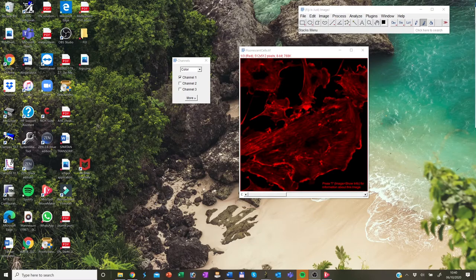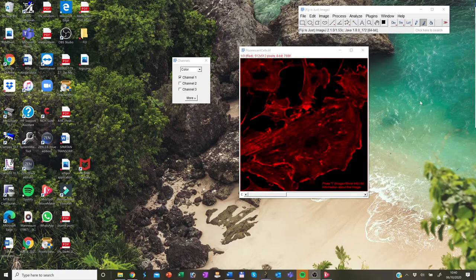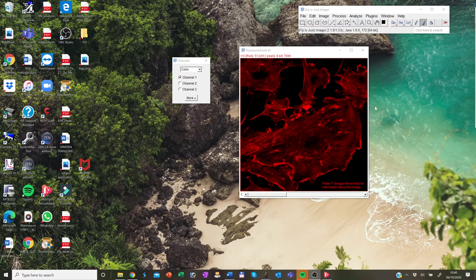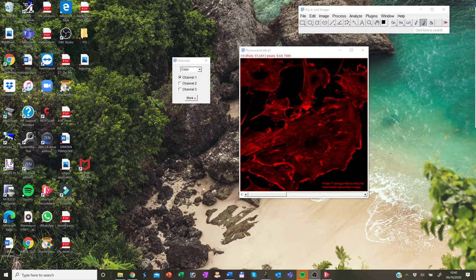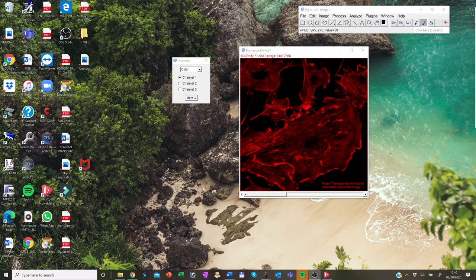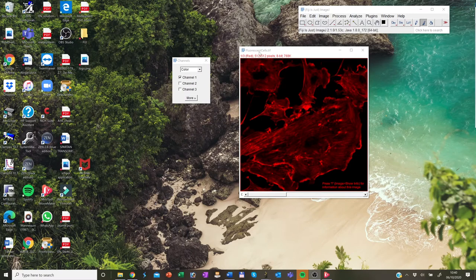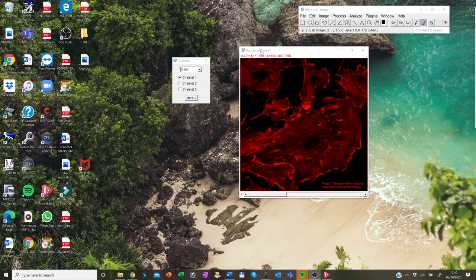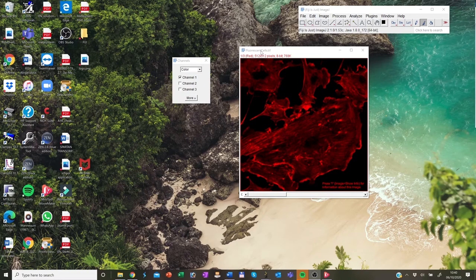Okay, now I'll show you how to set the scale bar. Most raw data images from our microscopes are pre-calibrated in micrometers per pixel, as can be seen in the information bar on the image window. If you have data from a manual microscope without any calibration, you can set the calibration so that your subsequent data aren't measured in pixels like in here, but you can measure it per micron.